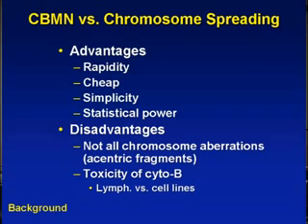So we said that this micronuclei, microscopic micronuclei method is gradually replacing the chromosome spreading for some of the reasons here that it's a very rapid method. In 3 days, you get a result. And for those of you who have done some of the chromosome spreading may argue with me, well, we can do the same thing in 3 days, so what's good about it? But the problem is that with micronuclei, you can get a final result in 3 days. With chromosome spreading, usually you take another 4 weeks to finish the scoring. But micronuclei, you can score them right away.